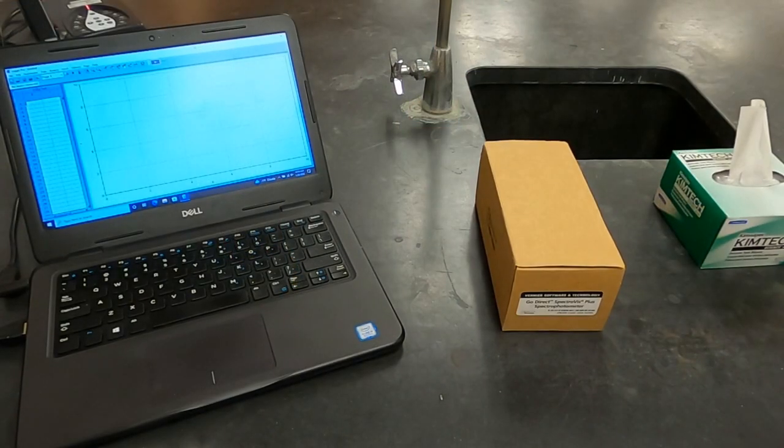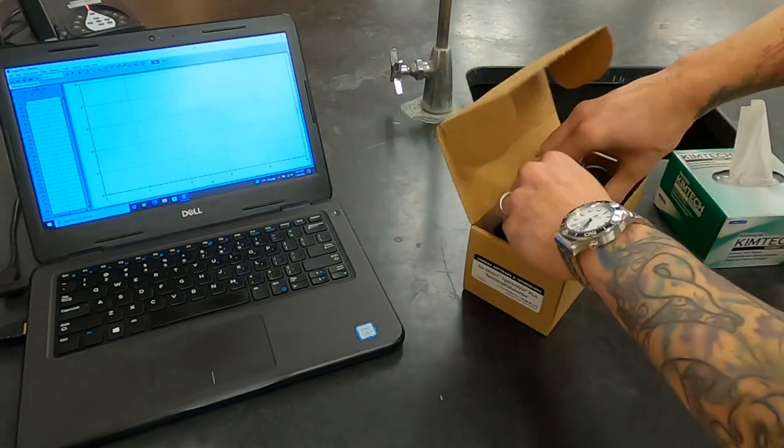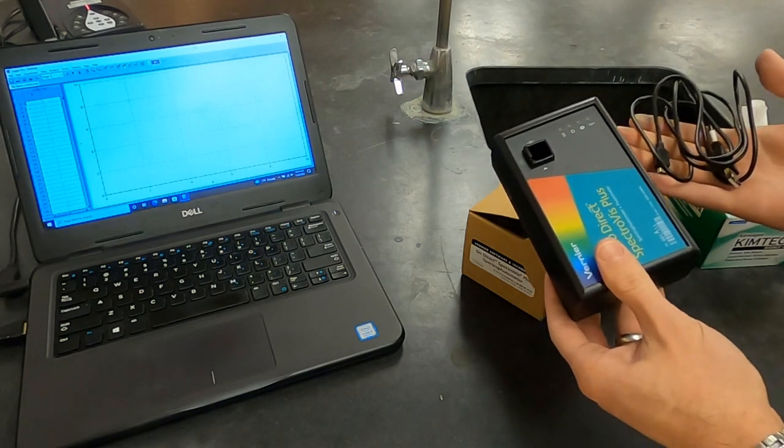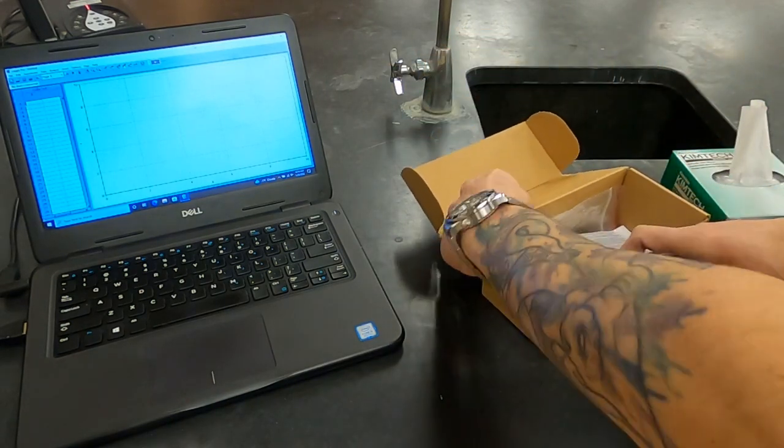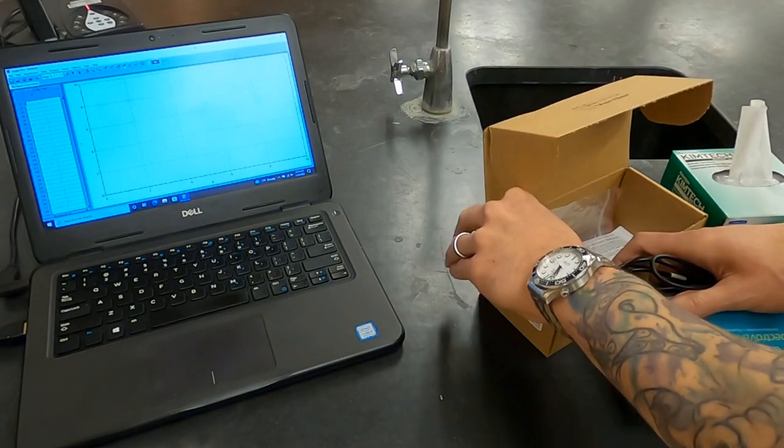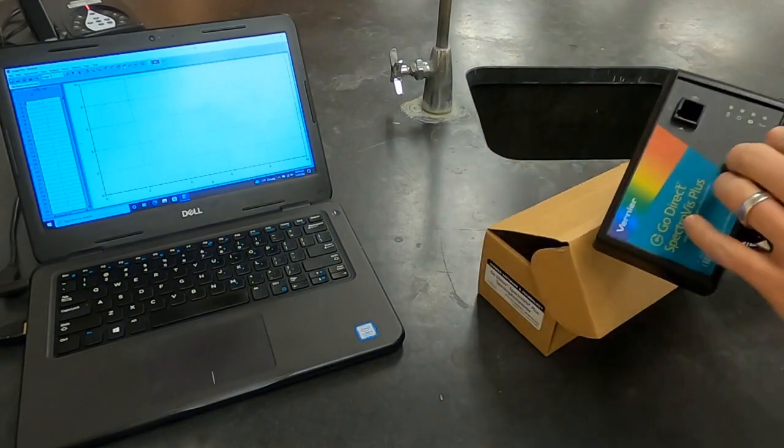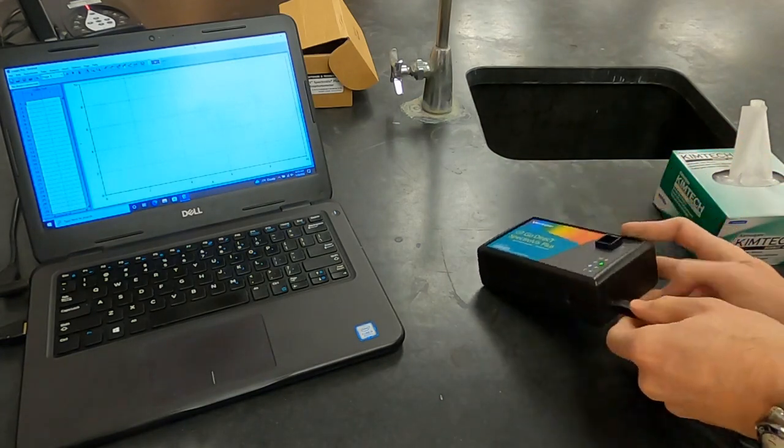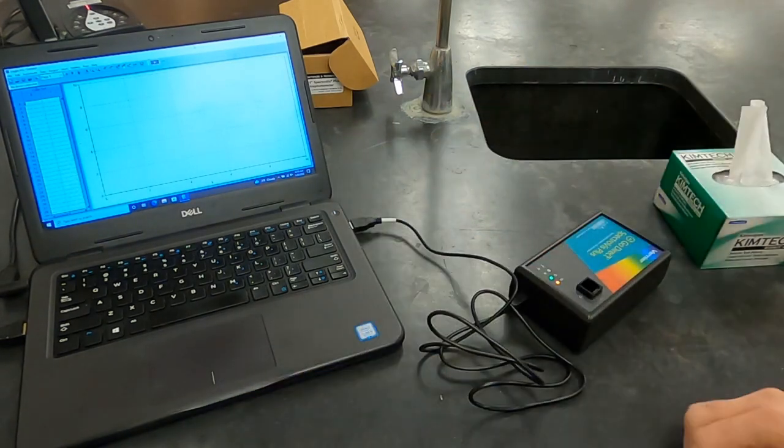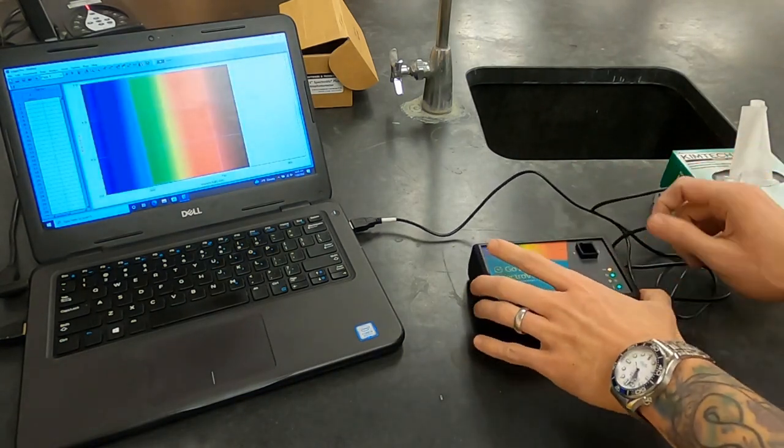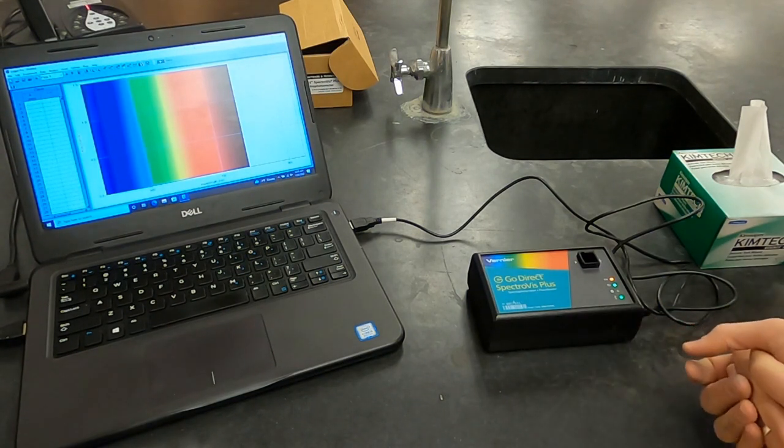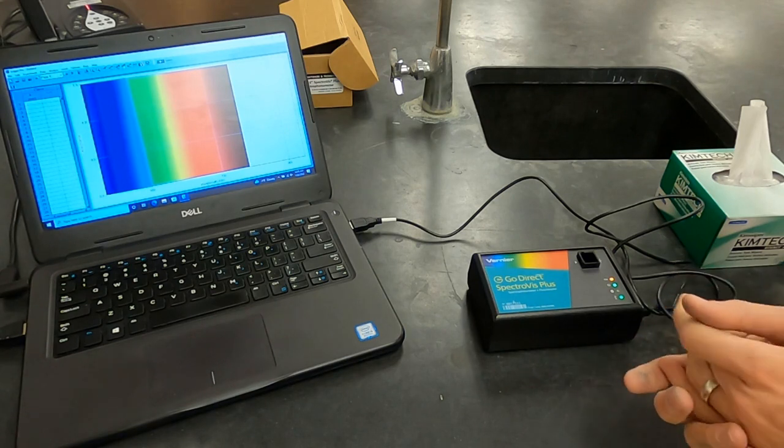Now I'm going to show you how to set up and run the spectrophotometer, the SpectraViz from Vernier Technology. Each kit comes with the SpectraViz, a USB cord, and a power cord. If you're going to plug it into your computer, you do not need the power cord. The power cord is if this were going to connect through Bluetooth to a device not hardwired. Note that you can have LoggerPro open before or after you plug it into your computer's USB port. It will auto-recognize what's going on and set it up regardless.